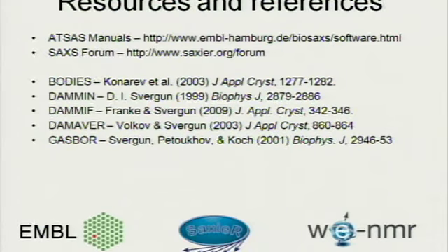If the protein is slightly flexible, then you can still try to do the ab initio modeling. One indication could be that the models would always come up in a very different way. You will get a very high NSD value. As a rule of thumb, the NSD value below 1 is good, NSD value above 1 is bad.